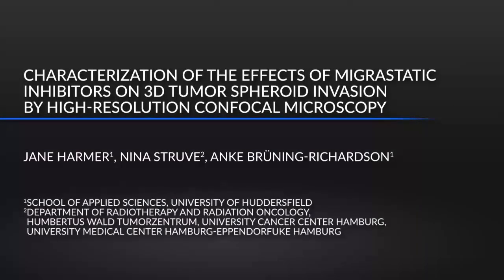This protocol is demonstrating that we can now determine the effect of migrastatic inhibitors in detail in 3D cancer models. The main advantage is the ease and all-in-one approach with which this technique can be carried out. This technique allows the assessment of migrastatic drugs in cancer research in a 3D setting, allowing the testing of drugs in a more tumor environment relevant setting.